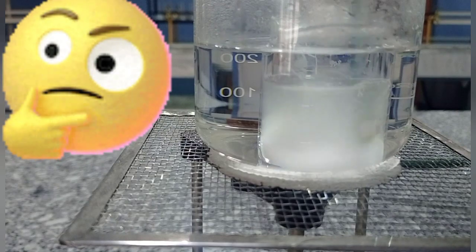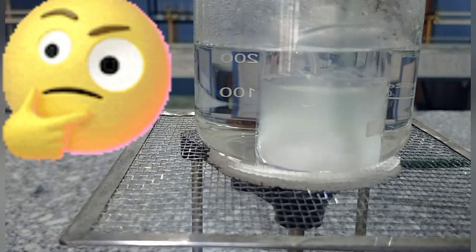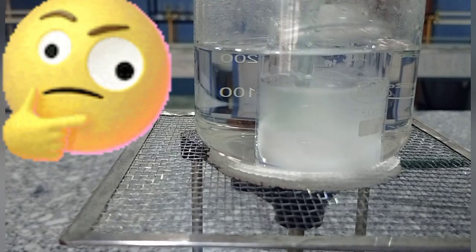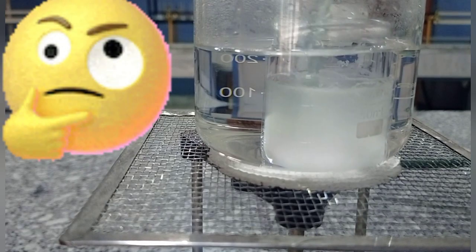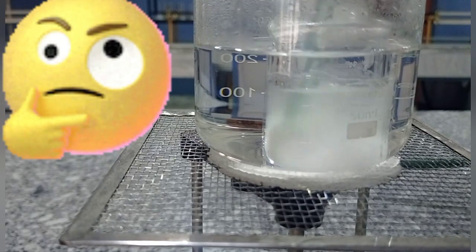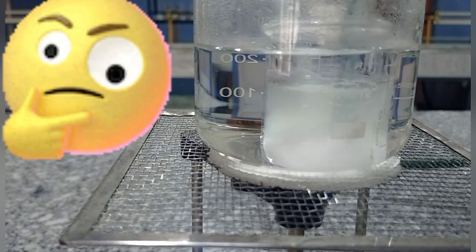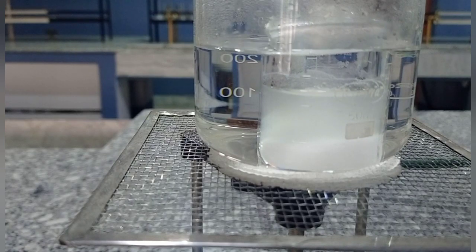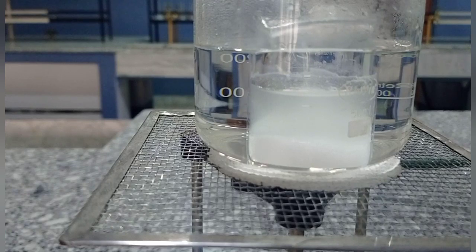My dear students, you can see gradually as I increase the temperature of this saturated solution, more and more amount of salt is getting dissolved. But wait, do not expect that the entire salt will get dissolved, but let us see whether much more salt is getting dissolved or not. You can see clearly that more amount of salt has already dissolved as the temperature of this solution is going higher and higher.